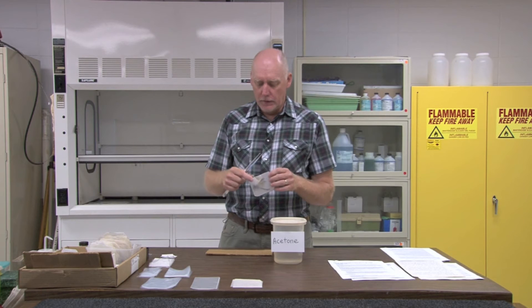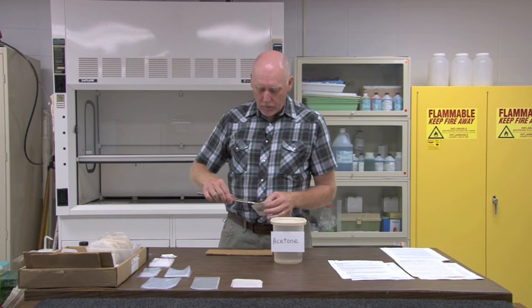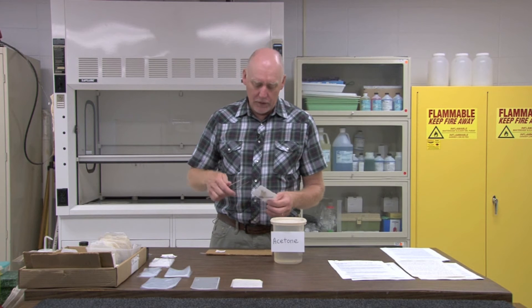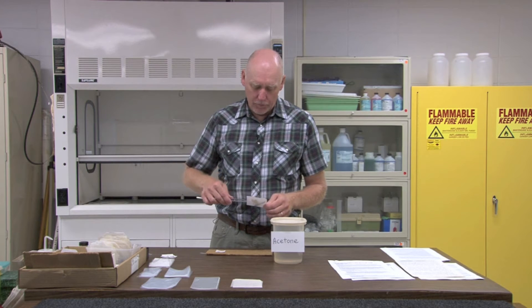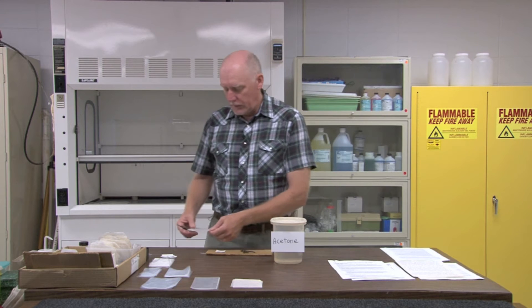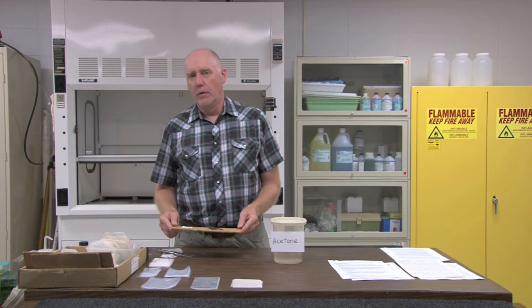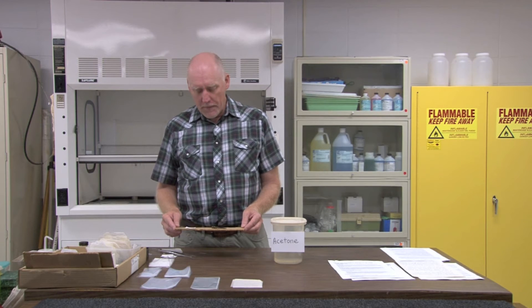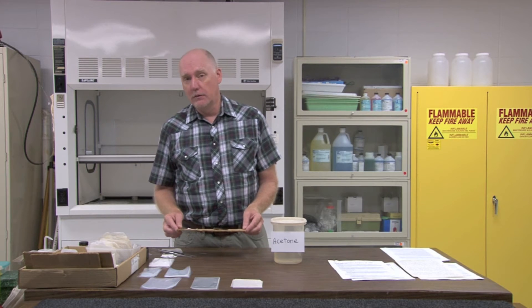After thirty minutes or so, the specimen in the envelope should be completely dry. At this point, I remove the specimen from the envelope and just place it on a piece of cardboard and allow it to dry now for about two to three hours. You want to make sure it's fully dry, so large specimens should dry longer than the smaller ones. However, don't leave it out too long or domestic beetle pests will attack the specimen.